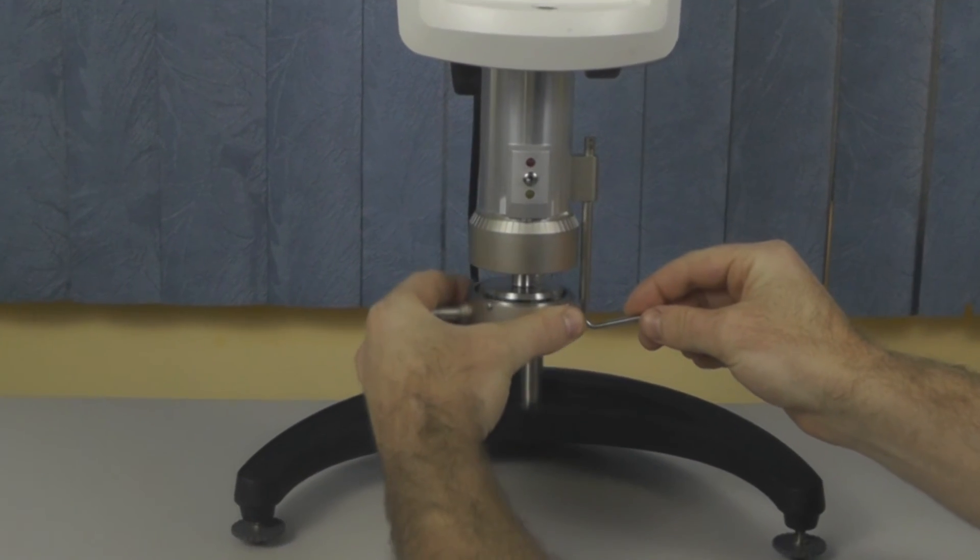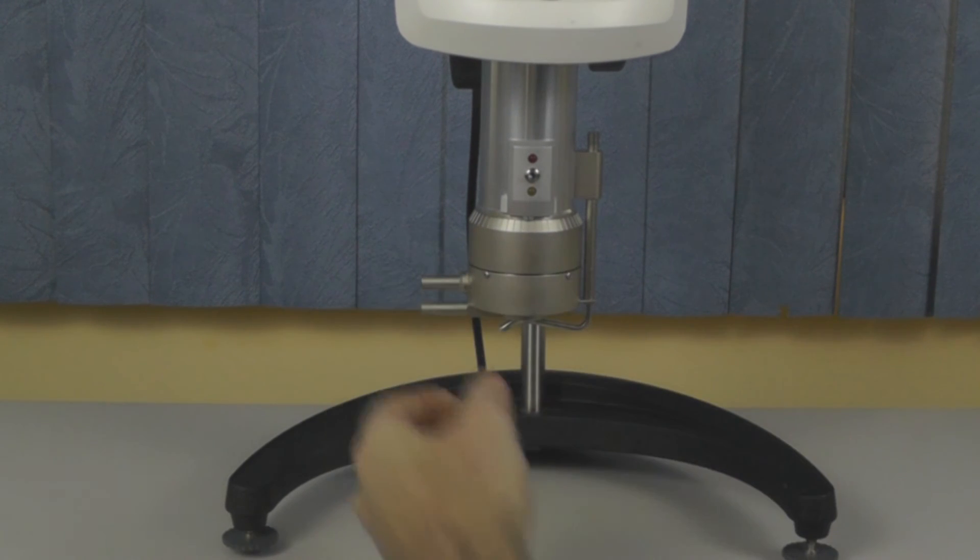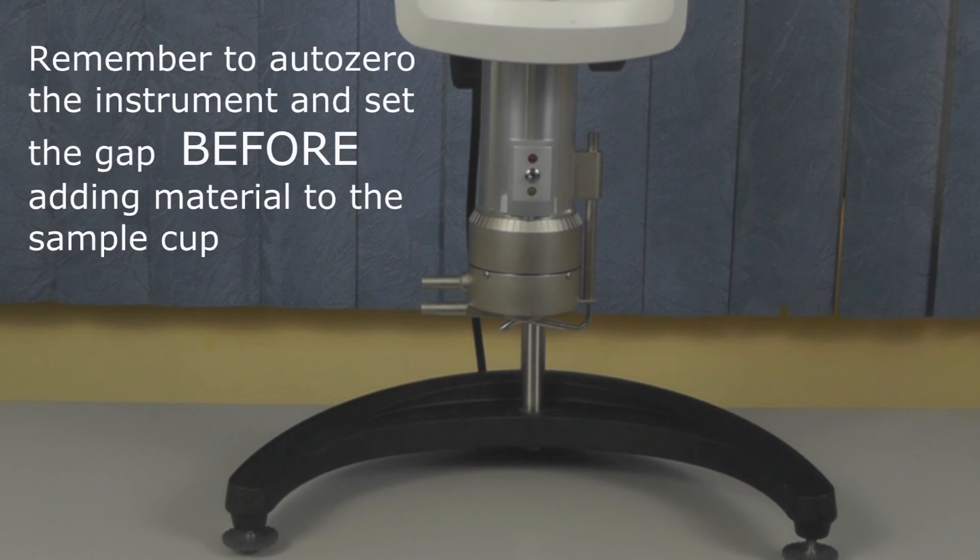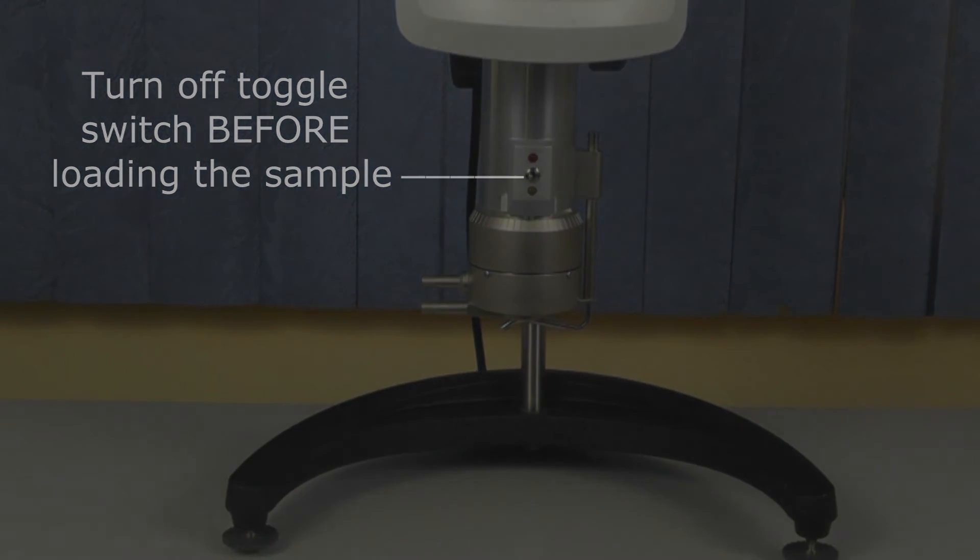As long as you have not compromised the position of the micrometer, the gap will not change and your sample will be ready to test. Remember to set this gap before loading your material onto the sample cup. It is also important to turn off the toggle switch after the gap has been set as the electric current may have an effect on the sample.